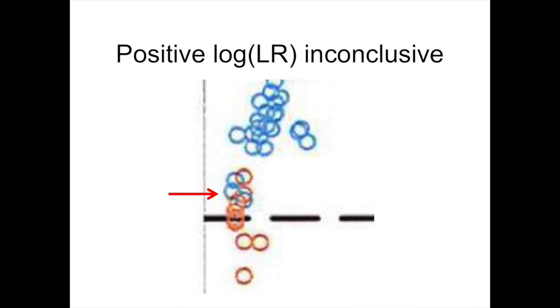So what we're doing is we're taking the small region, and in the area from 0 to 250 as the peak height, we're zooming in, and on this scale, this is around 1 million, that's 1 in a million, and this is 0. Here's the point. In the range of the data in this case, where we're looking at peak heights between 50 and 100, here are match statistics in the range of hundreds and thousands. Those are the values. And you can't distinguish the orange from the blue.